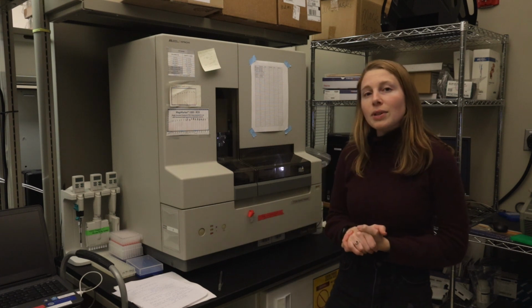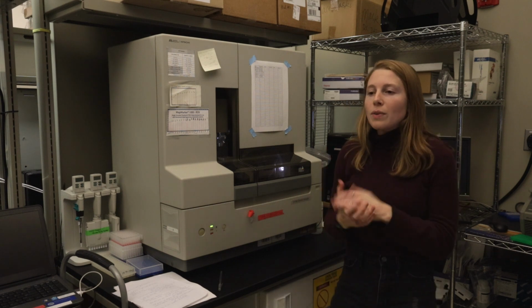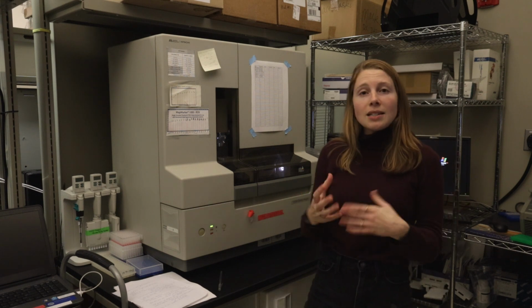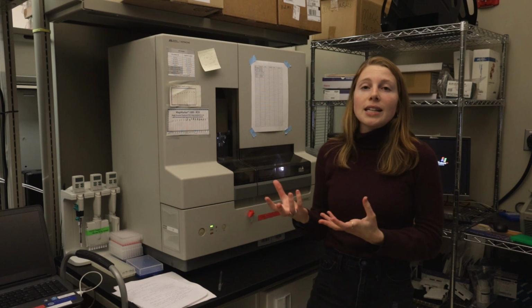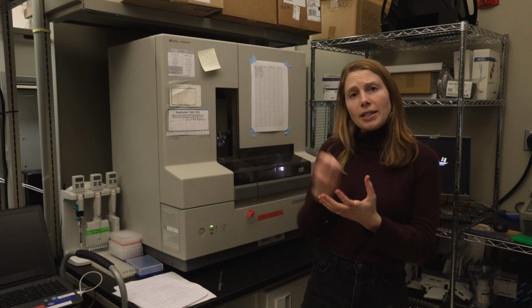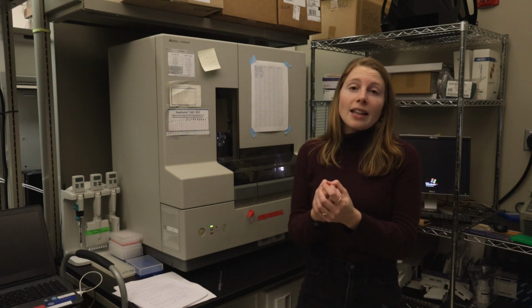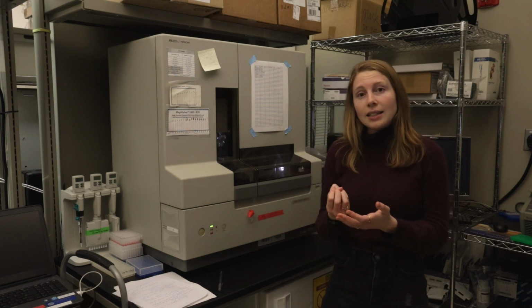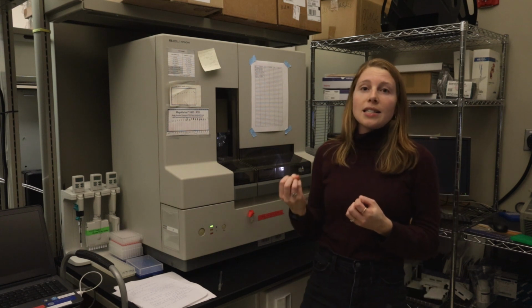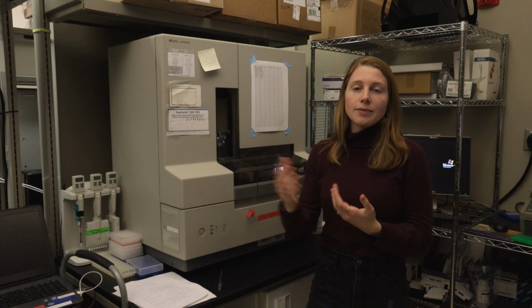The process with a Sanger sequencer is you have a template strand of DNA, and with it you add in dNTPs, nucleotides, and also nucleotides with the oxygen removed. And this means that when those nucleotides are added to the template strand, they stop the reaction. And they also have a fluorescent tag. And so each base has a different color. So A would have one color, T would have a different color, and so on.